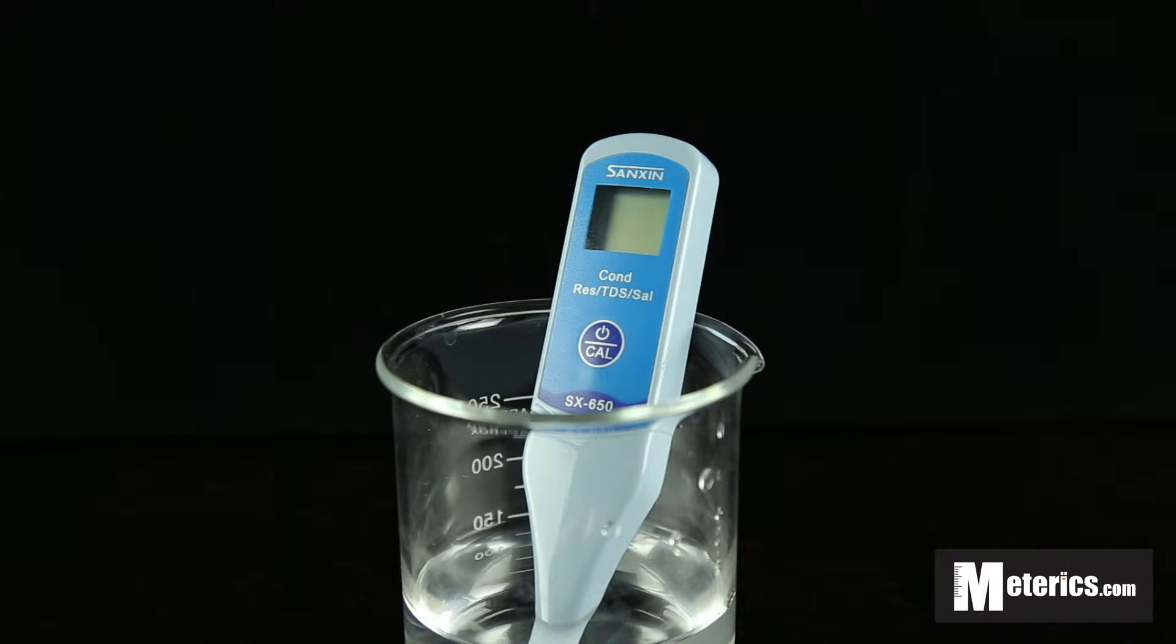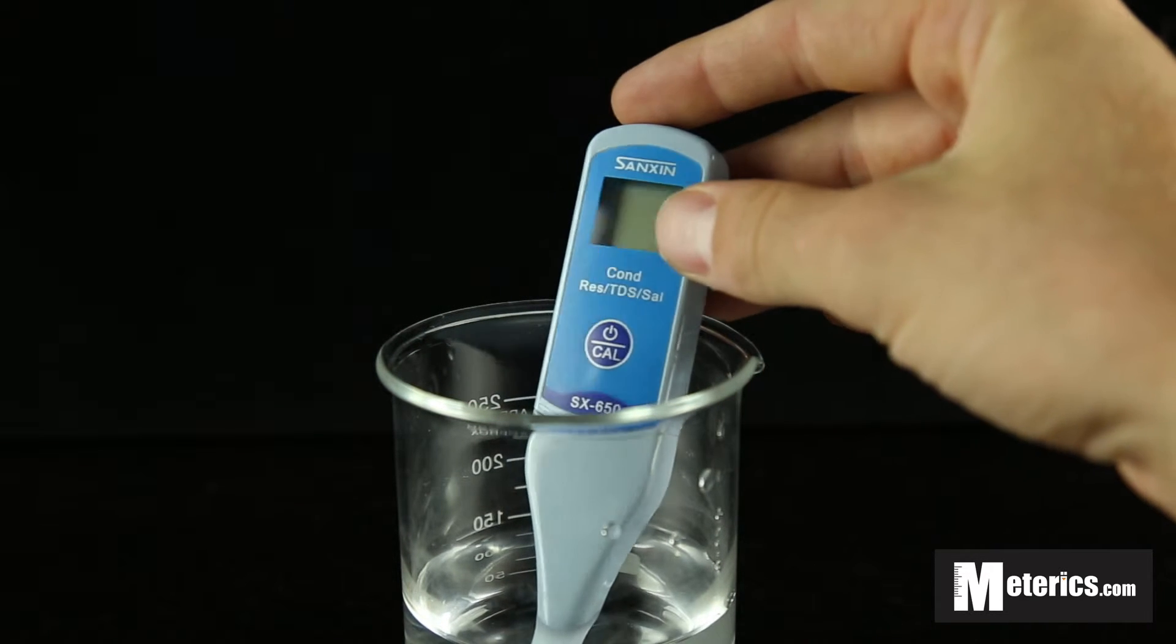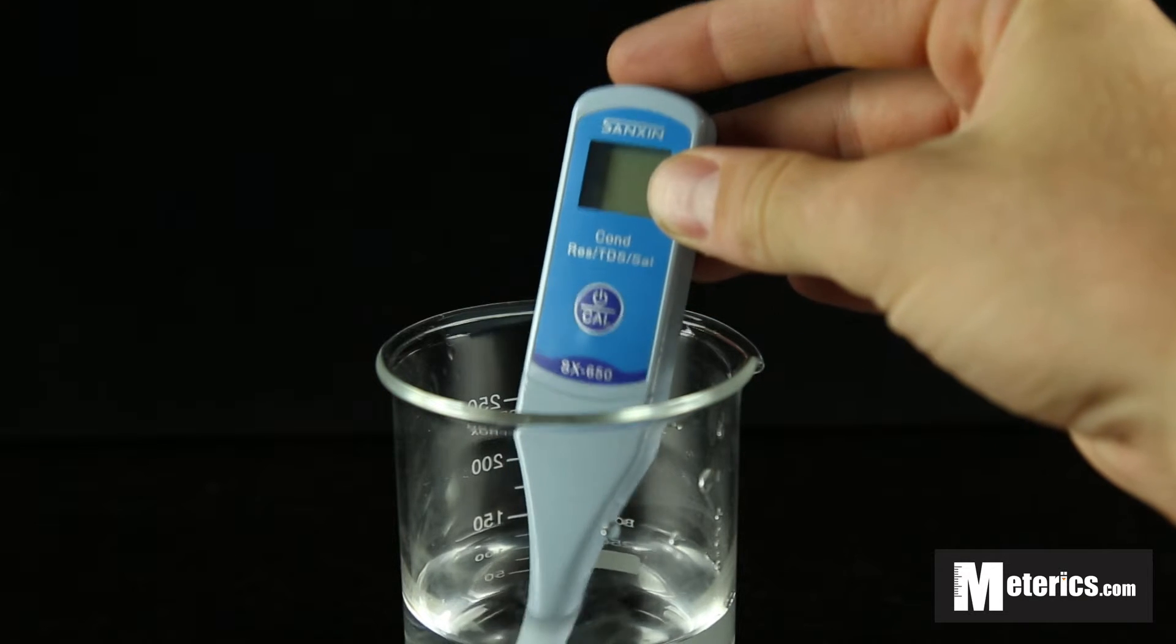Hi guys, here with Metrix and today we're looking at the Sanchin SX650 conductivity resistance TDS and salinity meter. This all-in-one meter is very compact and easy to operate.